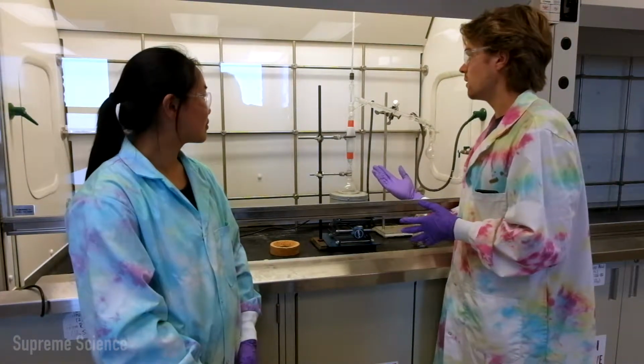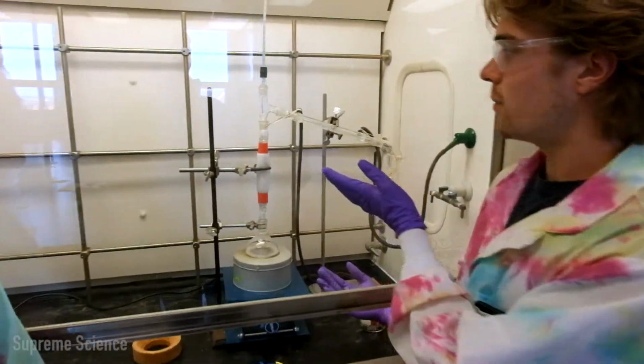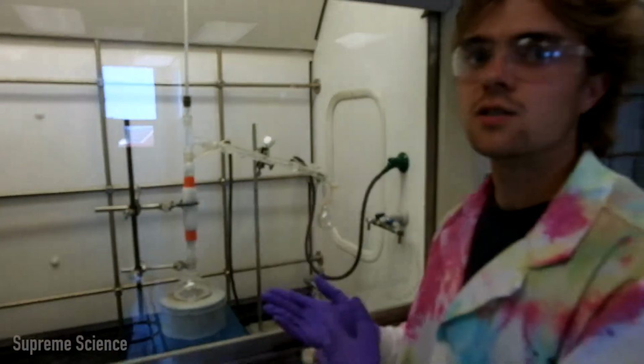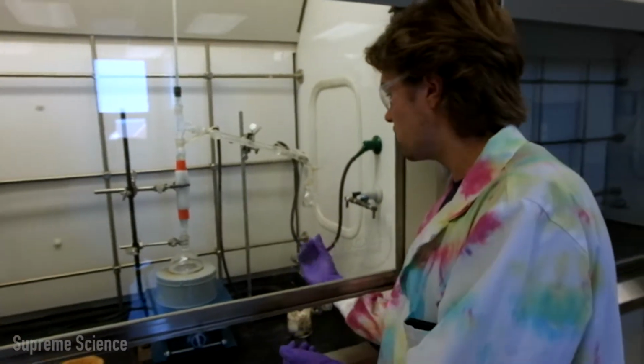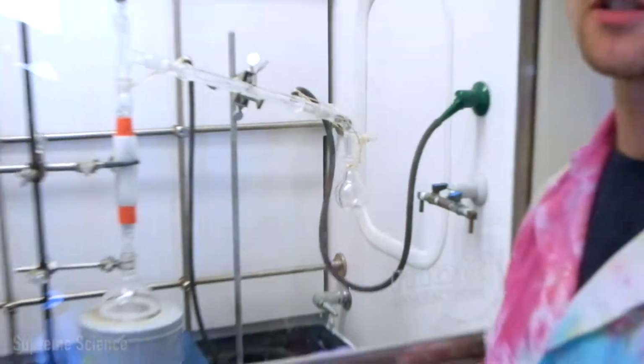We can tell because ethanol has a boiling point of 78. So once our thermometer reads a temperature above 78, we would expect that the water is starting to come into our fraction. So we would remove this flask and add an additional receiving flask to collect our next fraction.